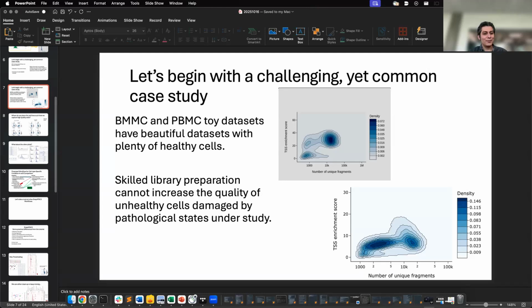Yeah, no, that's a really cool question. I don't have a great answer for the transcription factor question. But from what I remember reading in the paper about the nucleosomes, if you know that nucleosomes bind approximately 147 base pairs of DNA wound around them, that will leave a particular footprint. So that might give you a good clue as to how to find the nucleosomes in those footprints.